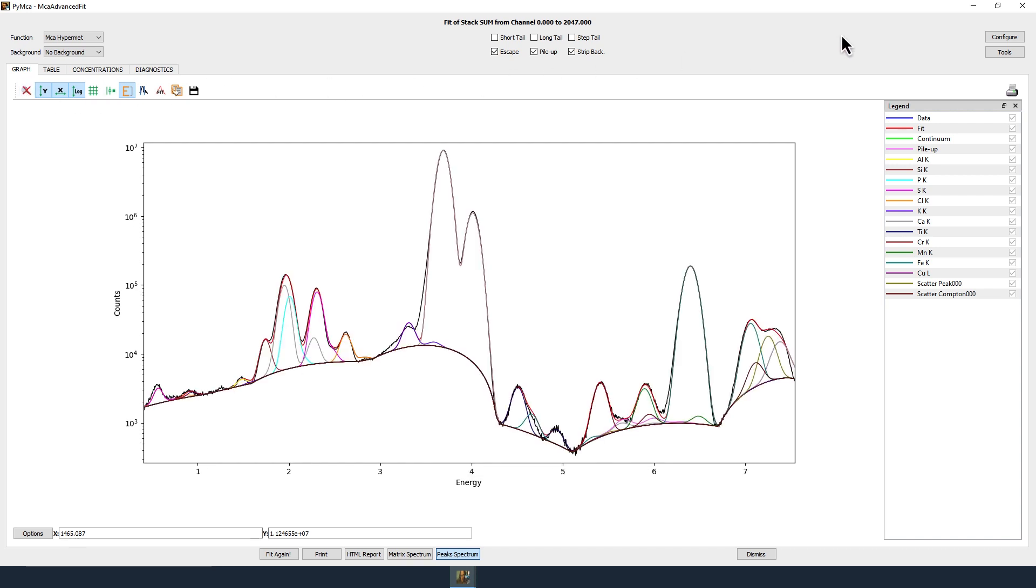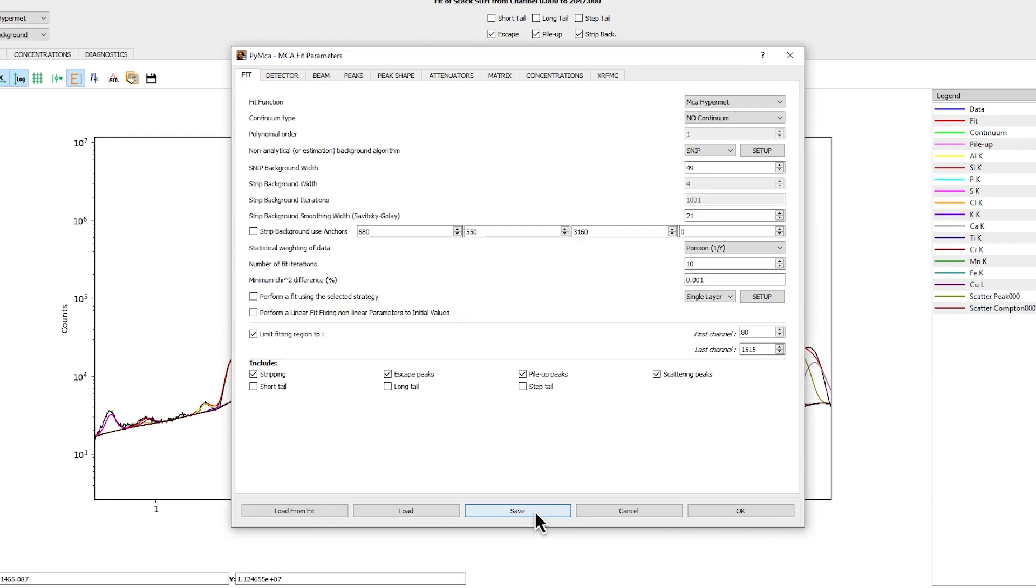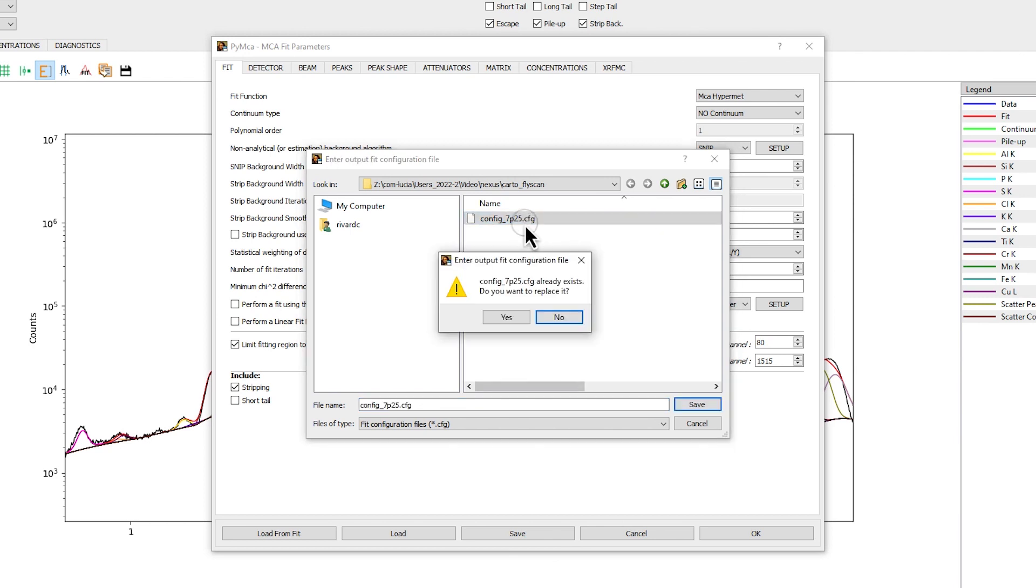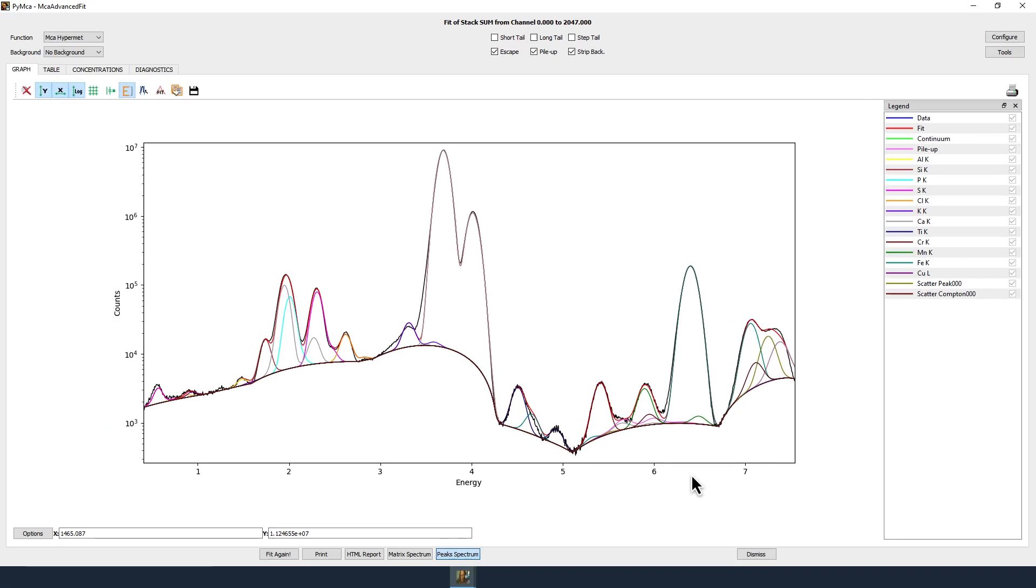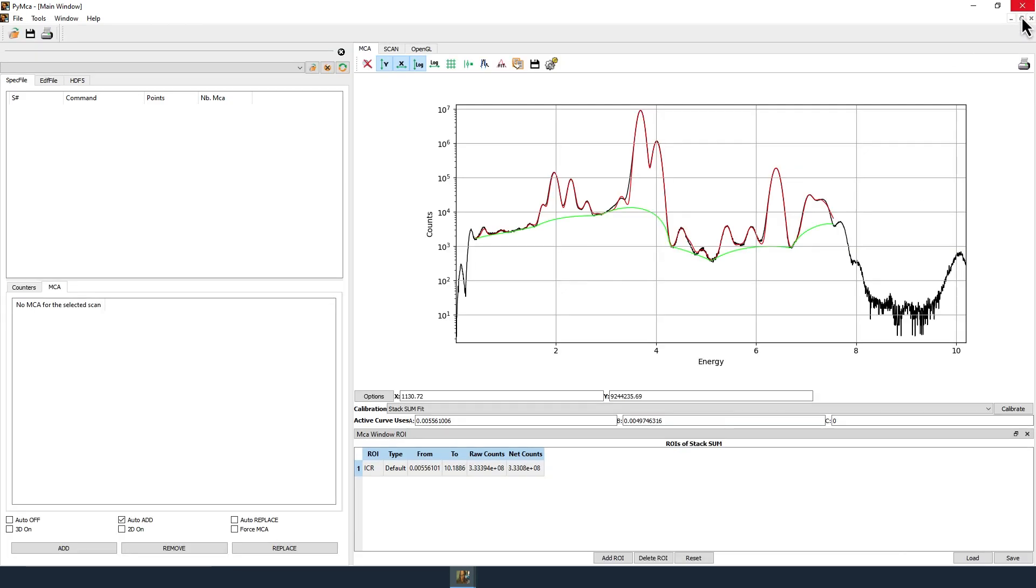When your fit is satisfying, save the configuration file in Configure then Save. Close the MCA advanced fit window.